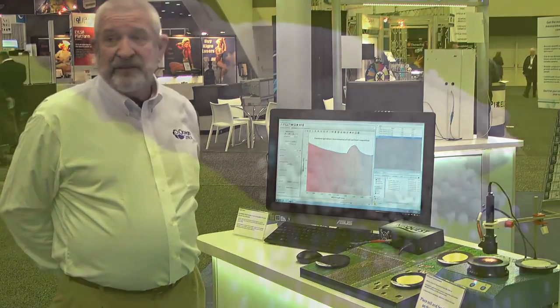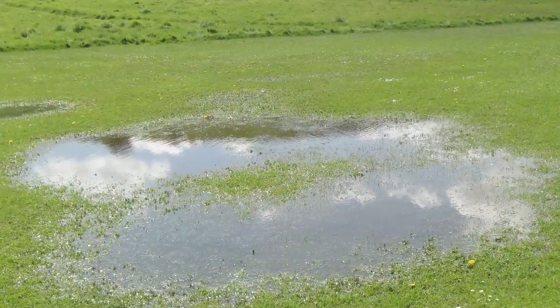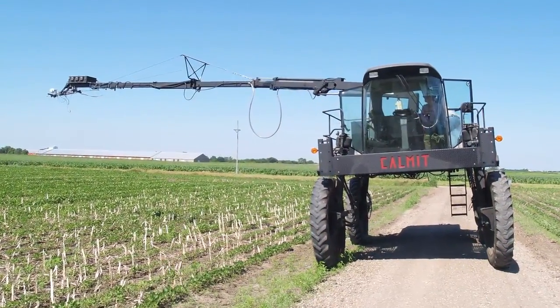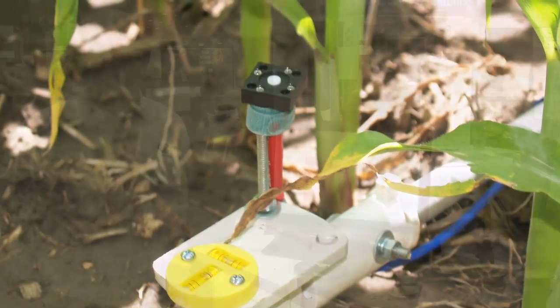And in the dirt, you can find urea, which is a source of nitrogen for the plants, you can find moisture, and you can look at the organic matter in the soil. And so better management of your farm comes from a sensor that can tell you where those things are abundant, where they're missing.